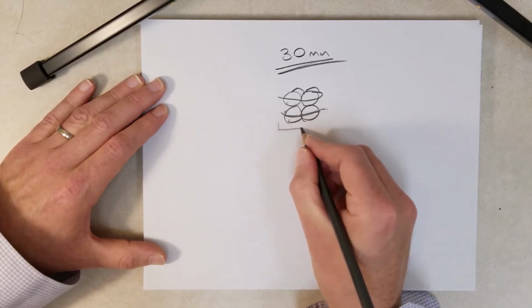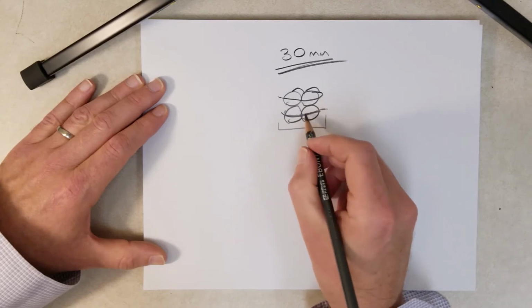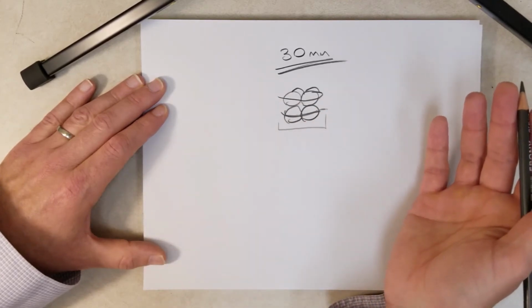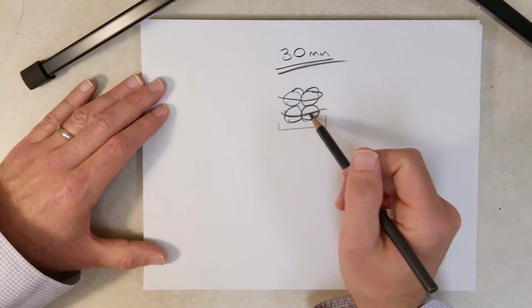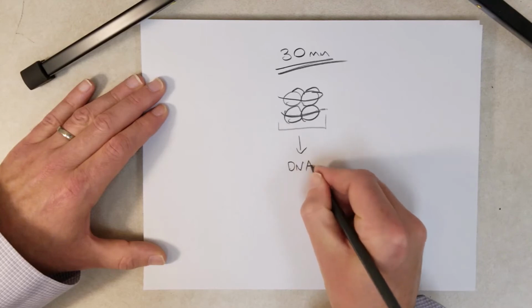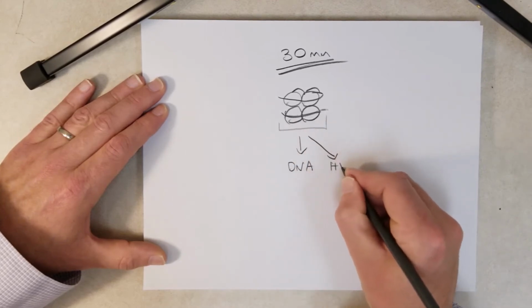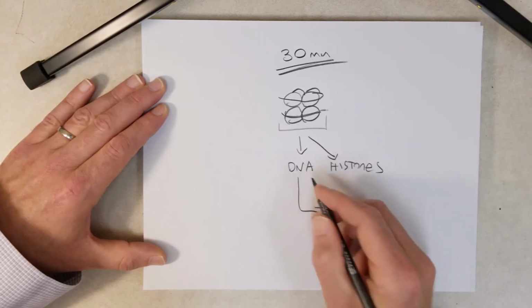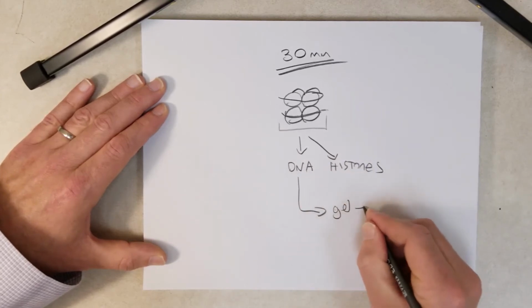Before we can check the length of this, and we could predict it'd be 146 base pairs, before we can run that on a gel, what we need to do is separate the DNA from the histones. And then we check that DNA by gel electrophoresis.